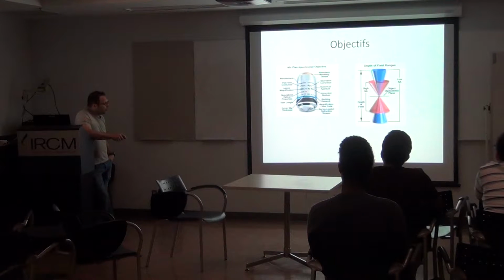You usually have the specialized optical contrast techniques that you can use written on it. There's always a color code also. If you see a yellow strip, you would know it's a 10x objective. Yellow is 10. Red would be 5x or 4x sometimes, so low magnification objectives will have a red strip. Blue is for 40 and 60. And black would be 100x usually.